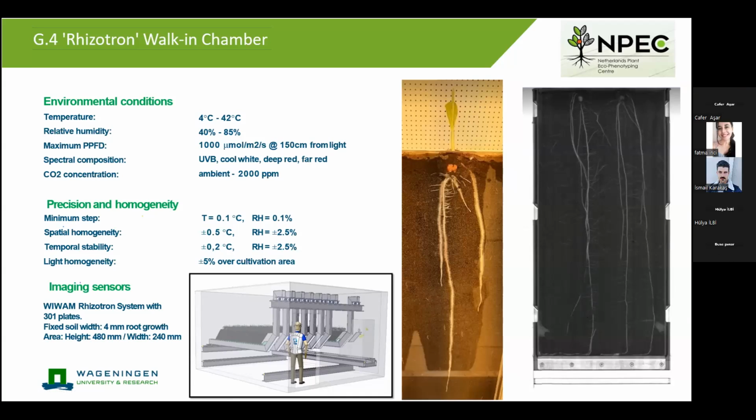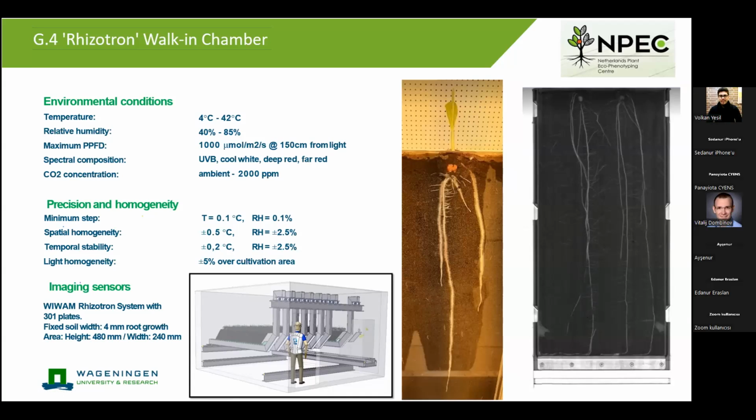So that's another challenge. Is this representative for the behavior of your roots in the field? That's actually an answer that I cannot give you. And it will probably matter what kind of soil you put into this rhizotron, what kind of experiment you are validating. And that requires many experiments that we will do in the upcoming years.